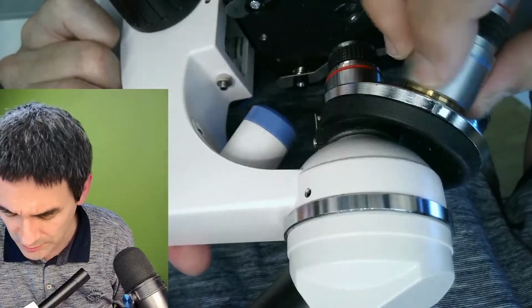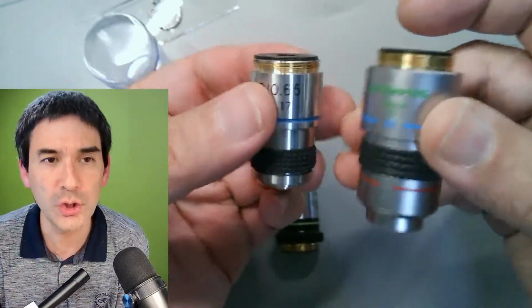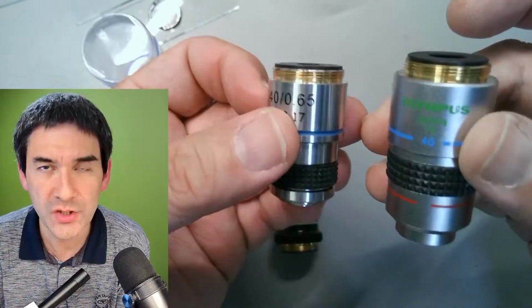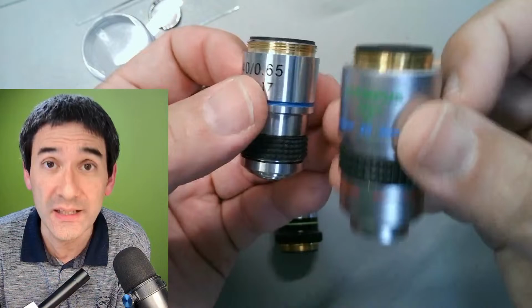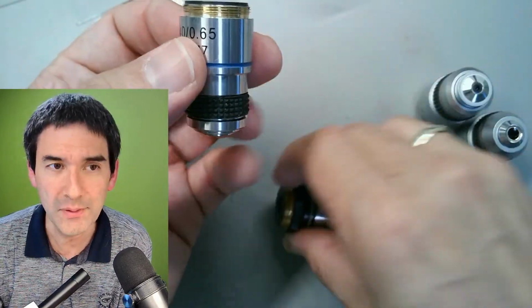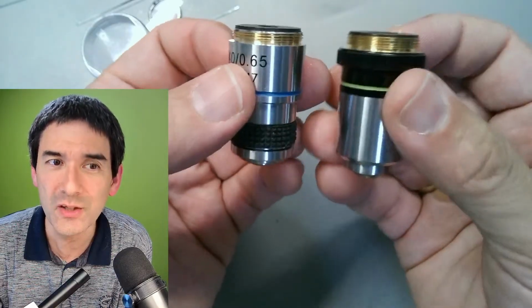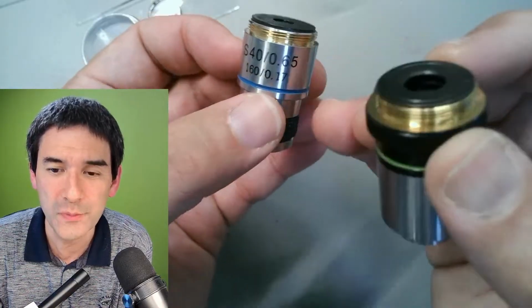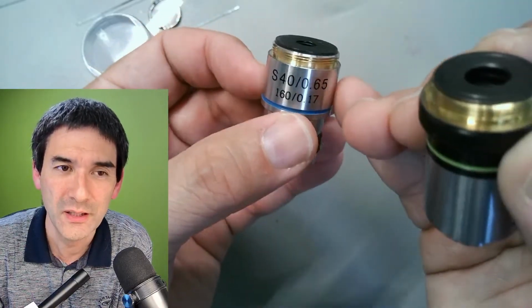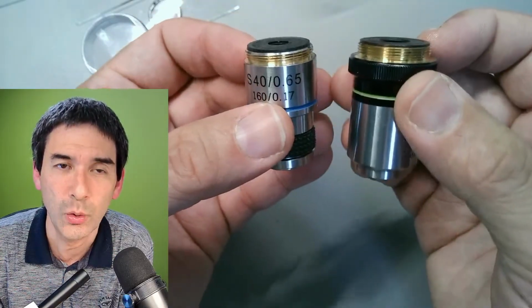So what in the world is going on here? And the reason is because those two objectives have a different conjugate distance. This one is a so-called short barrel objective, which has a conjugate distance of 185 millimeters, and these are the standard ones of 195 millimeters. And the old Olympus objective over here also is a short barrel. So this is the old Olympus system. So I find it interesting that some of the modern introductory microscopes are actually using the same system size of objectives like the old Olympus microscope.